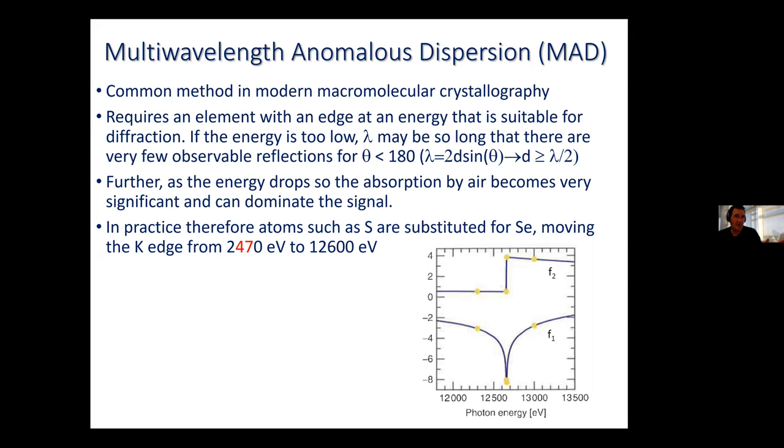And in general terms, in terms of crystals, 5 angstroms is a very, very big d spacing. And if you could only perform diffraction experiments with 5 angstrom radiation, 0.5 nanometers, you'd only end up looking at the biggest d spacings and there'll be very, very few of them. So yes, you can, in principle, perform diffraction from the sulfur edge, but you'd end up with very few spots. And that gives you relatively little information from which to solve the crystal structure.